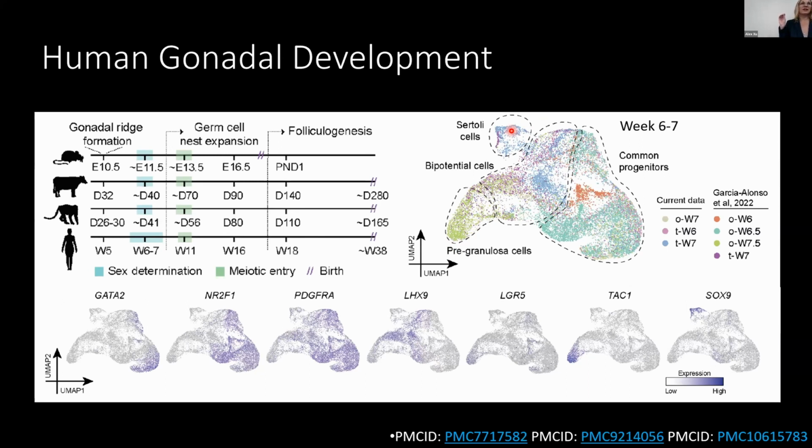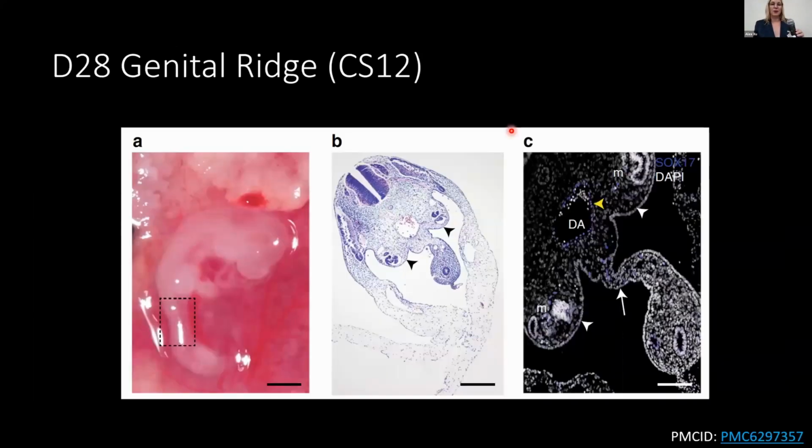And so where we feel that spatial transcriptomics has an extremely important role to play is to evaluate the spatial orientation of the emergence of these cell types in these very, very early organs to form. And I should say these organs are probably composed of less than 1,000 cells. And also they're very difficult to dissect because they're attached to the mesonephros. So again, 10x genomics and single cell approaches where we're looking at single cell suspensions of cells have reached the limit of what we can actually do to understand lineage specification, which is where spatial has become so powerful for us.